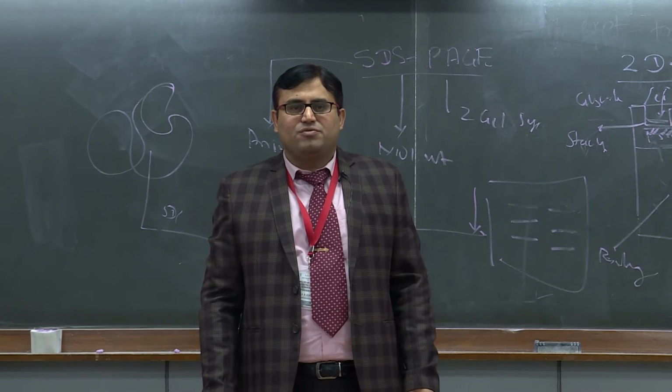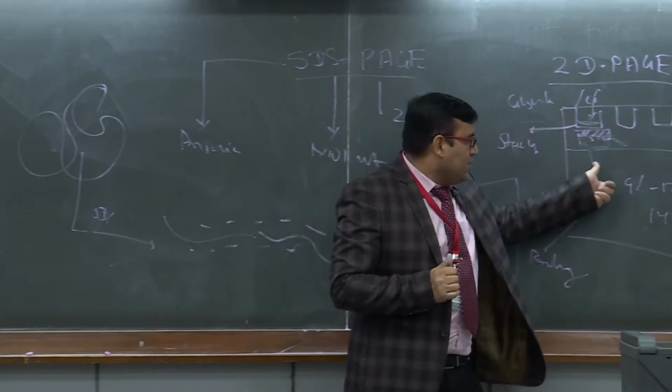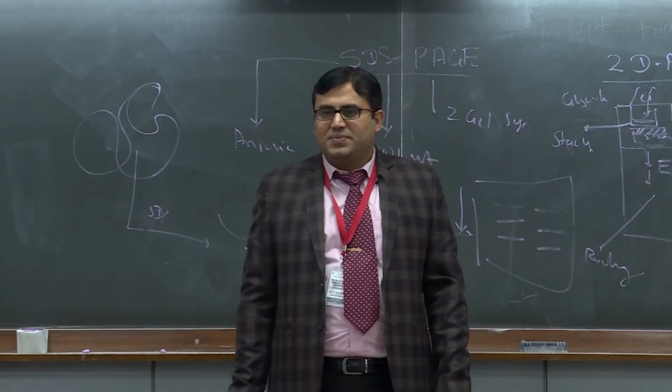Now the rippling effect will be neutralized, and from here onwards the movement of the protein will be purely based on the electric field.